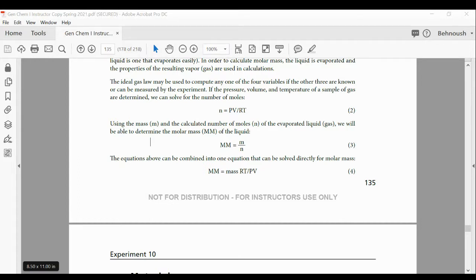Next item, we need to find also we need to record the temperature. Caitlin, Jennifer, Garrett, and Carmen, can you tell me how do you measure temperature, or what you measure temperature for in that formula? Okay, what is measured? You are using thermometer to measure it, and you express it in, then you convert to Kelvin. That is right. But what are you measuring? What is temperature?